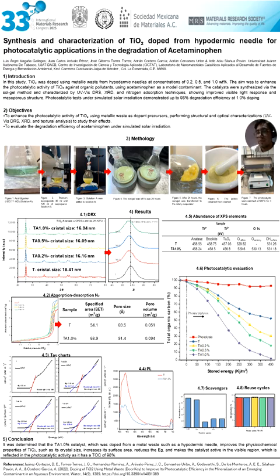Section 4.4, photoluminescence spectra show the recombination in doped titanium dioxide. It shows a lower recombination rate. Ta1% has a lower intensity, which is good. Section 4.5, XPS table shows elements interacting with oxygen. In the case of Ta1%, this causes energy level shifting, confirming a metal doping incorporation.